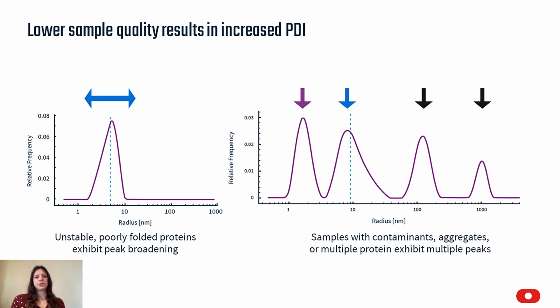Now, another thing DLS tells you is the size of your particles. While the hydrodynamic radius may not tell you much for a single sample in a vacuum, when you're comparing all those conditions and constructs, it's helpful to look at. The size of any biologic treatment is an important consideration when it comes to cellular uptake. And that's often a more downstream consideration than what you may be thinking about during early development, but it's still really useful information to collect very early on.